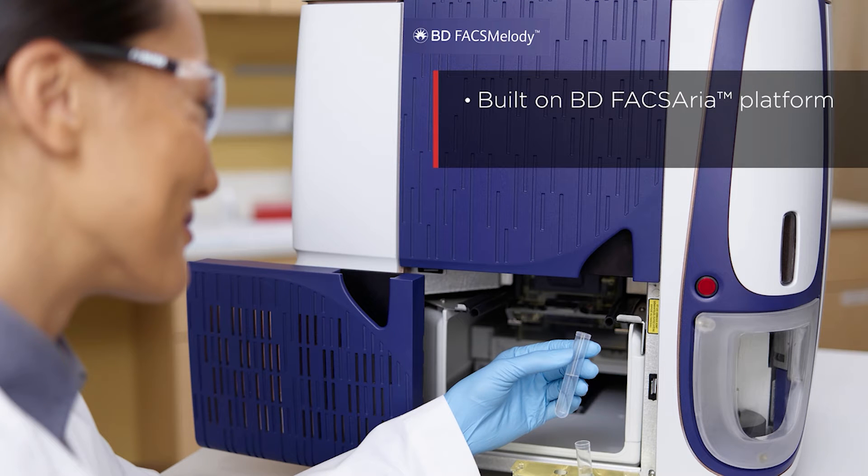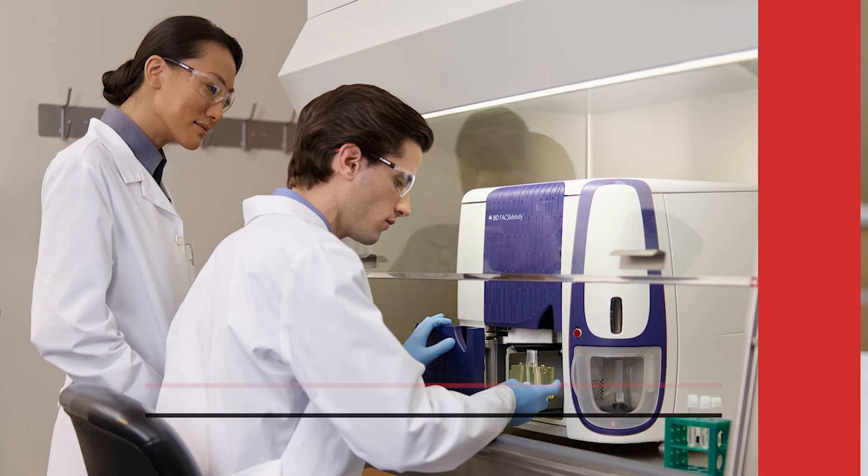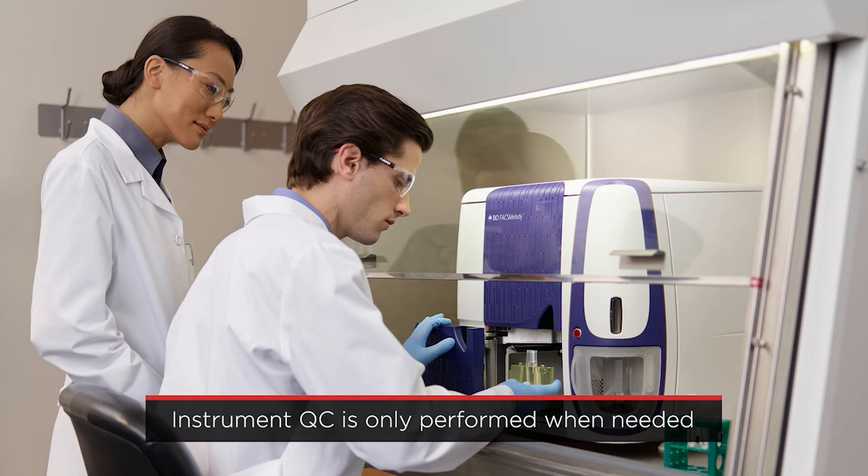The BDFAX Melody is built on the BDFAX ARIA platform of cell sorters and features lasers with fixed alignment, which means there's no lengthy procedure with alignment beads required at startup. Instrument QC is only performed when needed and is not required each time the sorting nozzle is installed.